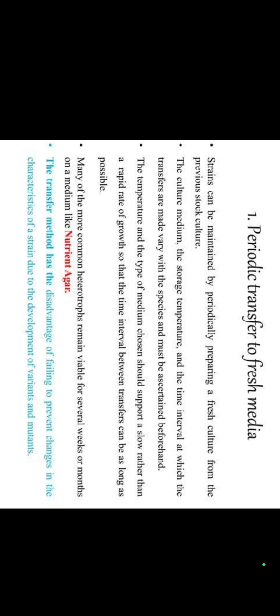The temperature and the type of medium chosen should support a slow rather than a rapid rate of growth so that the time interval between transfers can be as long as possible. Many of the more common heterotrophs remain viable for several weeks or months on a medium like nutrient agar.